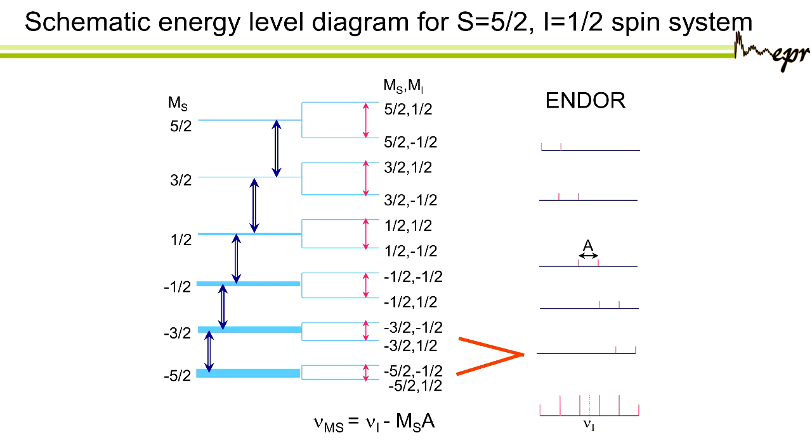Okay, so this is what you expect to see for this concanavalin A. Now we know that the half minus half transition is very sharp, so it will dominate. But under this you have some other transitions, and you can see the others, but much weaker. Okay, so usually we see mostly this one.